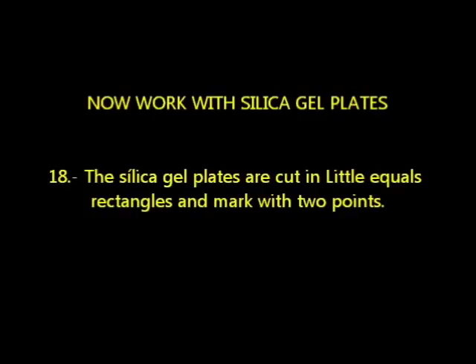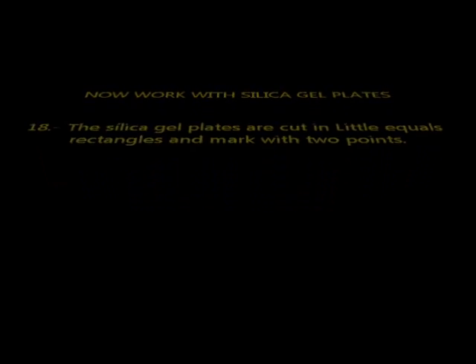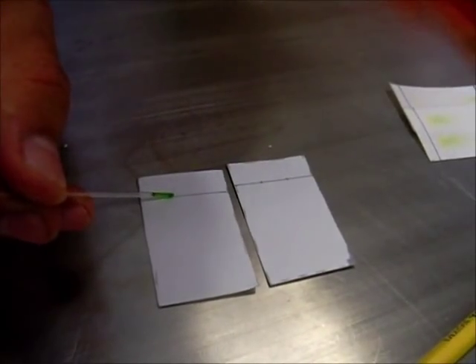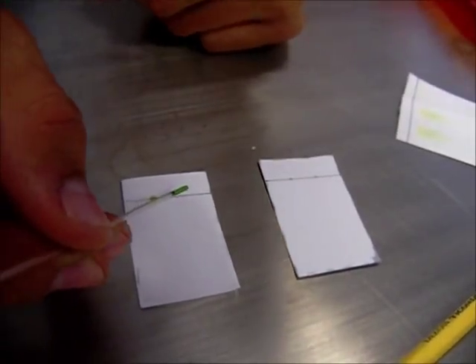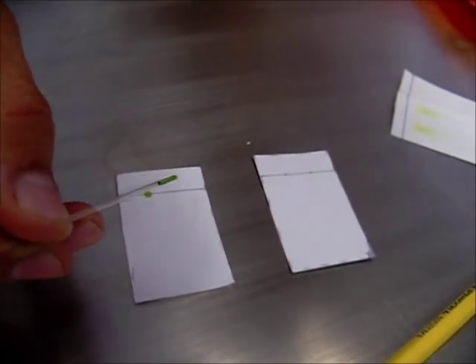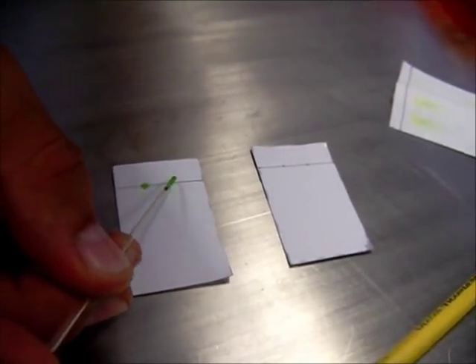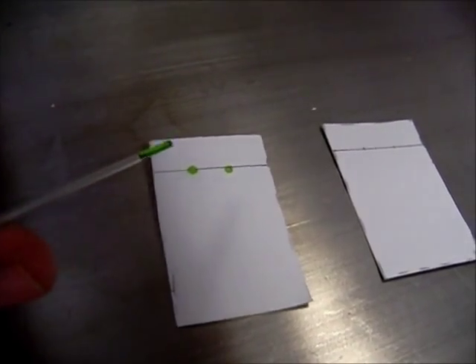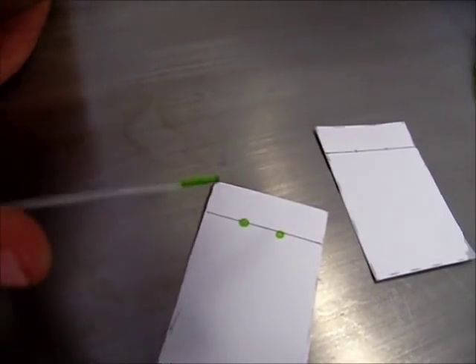The silica gel plates are cut in little equal rectangles and marked with two points. Follow the same process as the rectangles of filter paper.